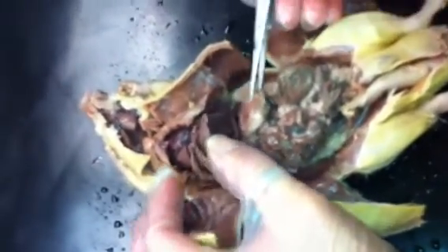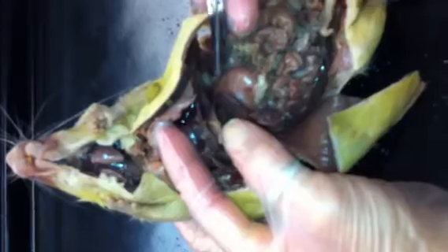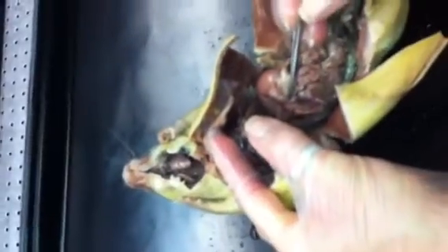And it can be a little difficult to see the J shape to the stomach, because the rats are so small that you might need to actually kind of move things around. But you can see how big the stomach is. It goes all the way back there. And so the J goes this way, and the end of the stomach is approximately right here.